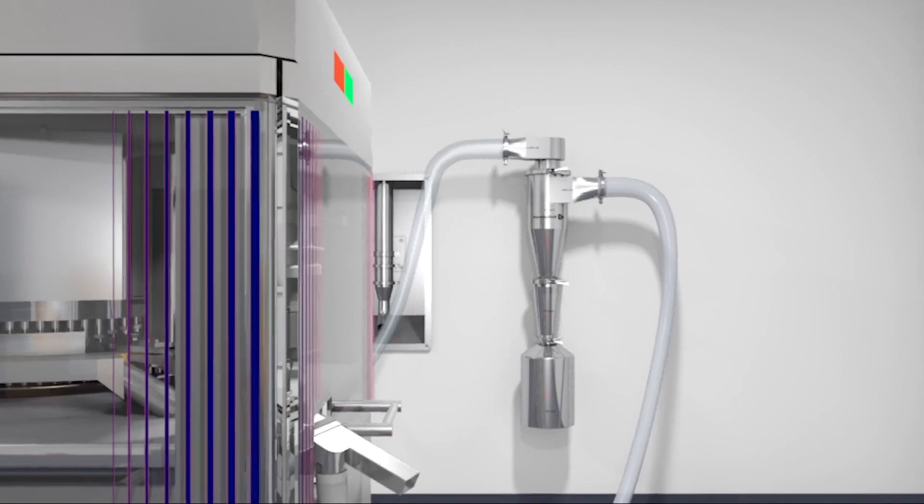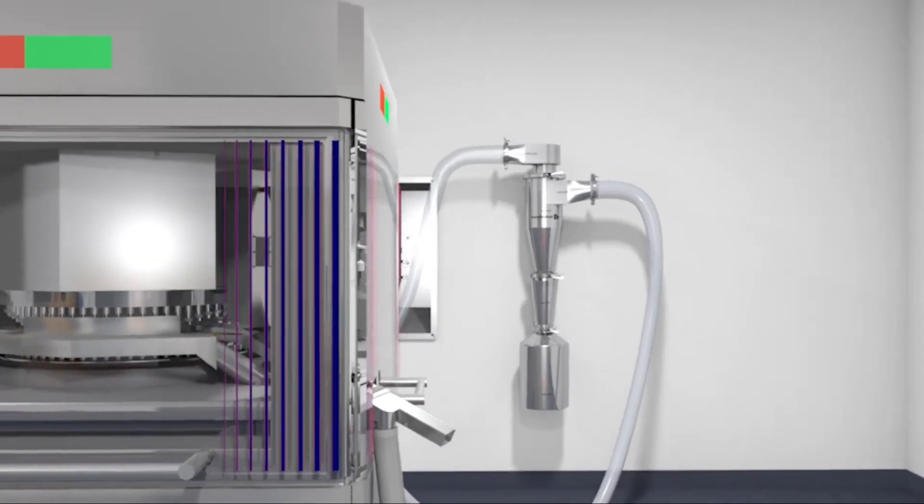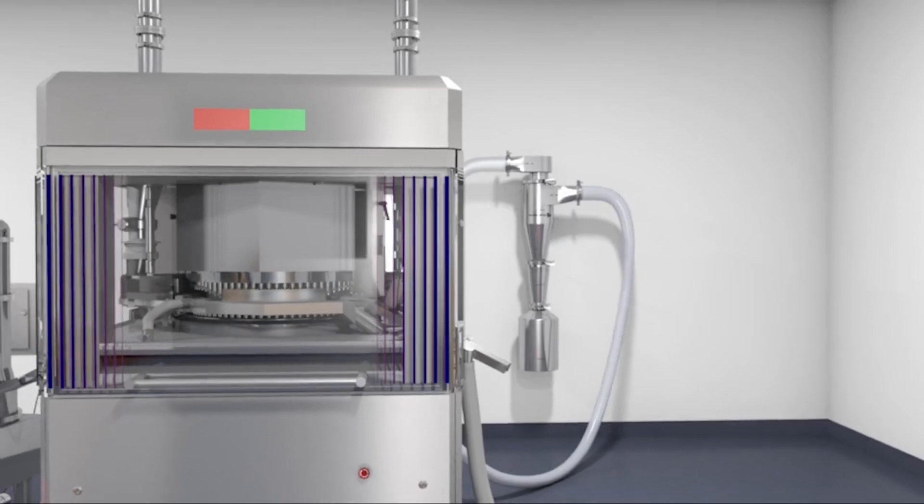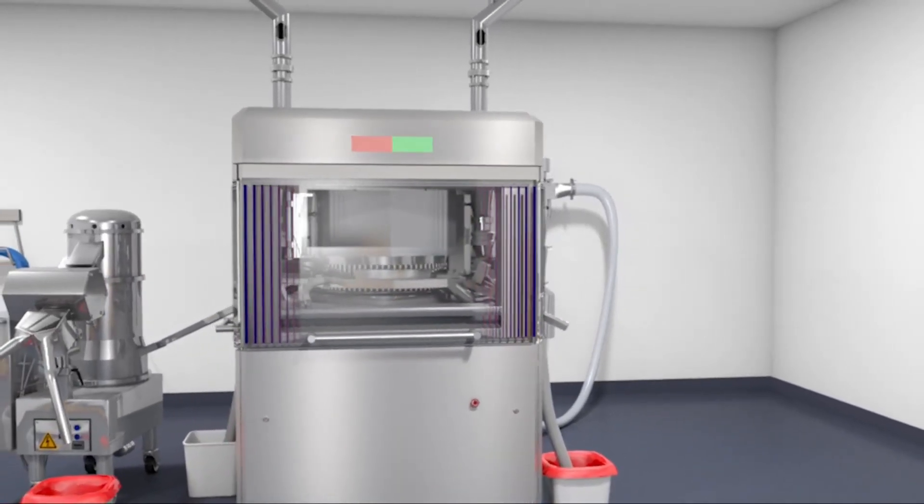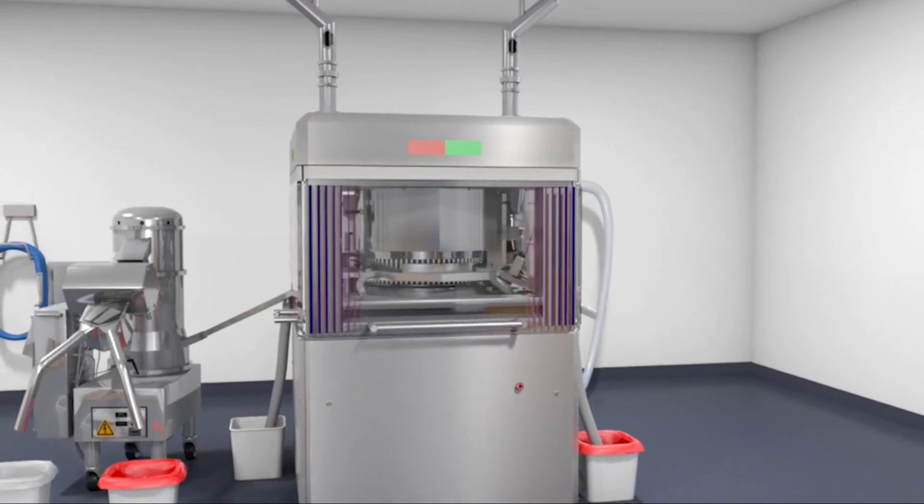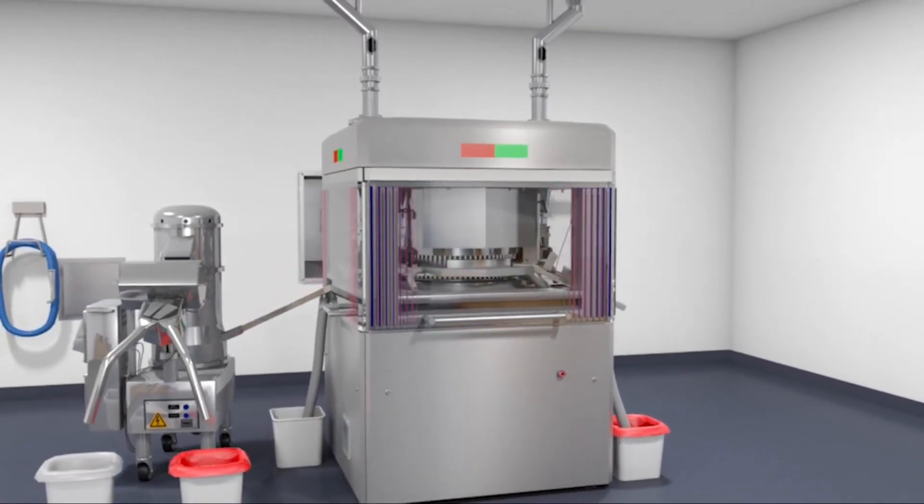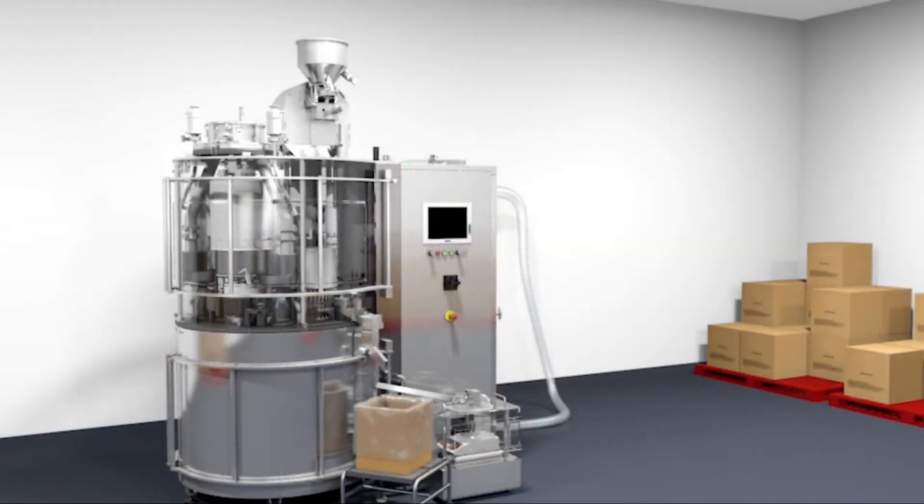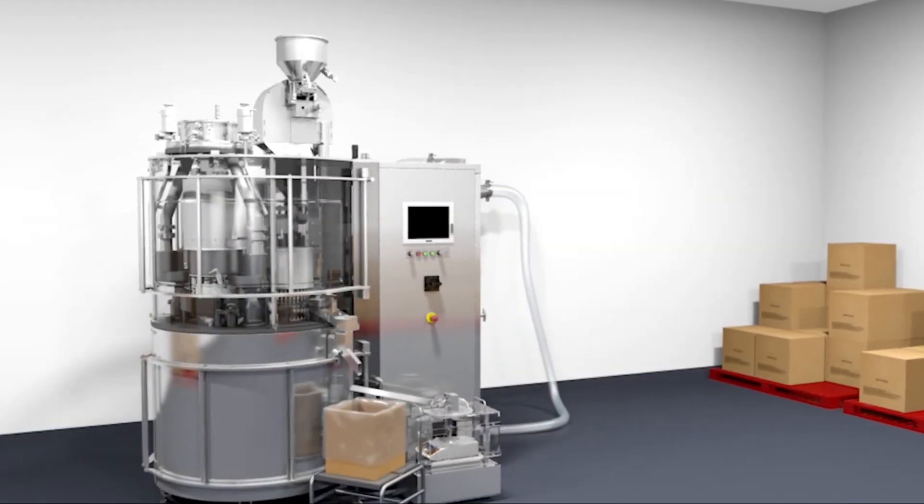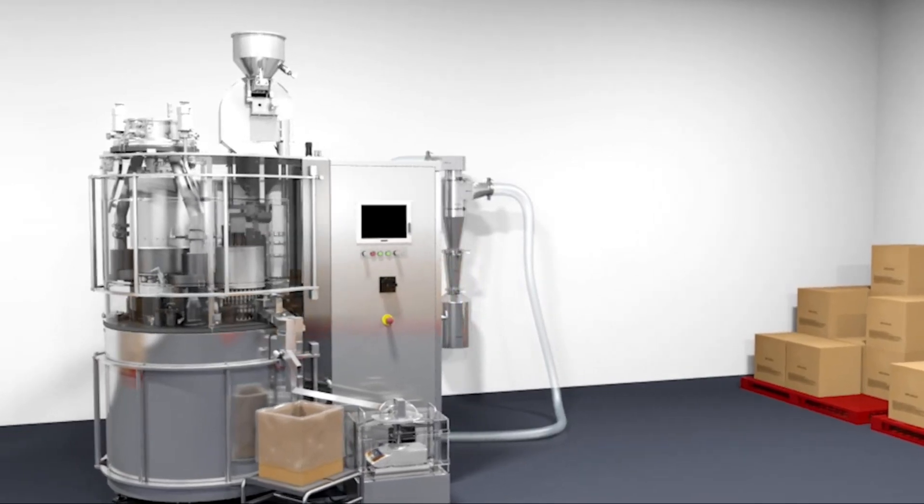The Hanningfield Unidust Cyclone has been successfully installed onto various industry standard compression machines such as Fette, Manesty, Korsch, Hata, and Stokes, and capsule filling machines such as MG2, Bosch, Killian, Zanasi, IMA, and many more.